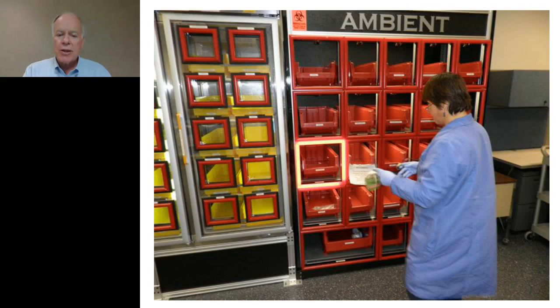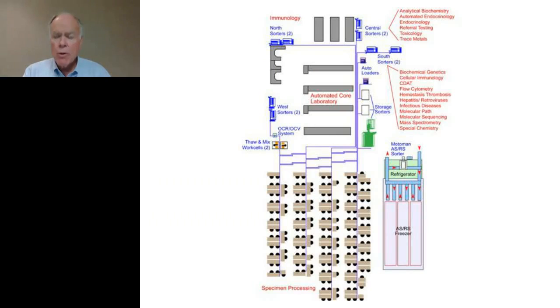So that's the sort-to-light system, and there's a section like this for ambient specimens and a section for frozen specimens and another section for refrigerated specimens. We're now building more of those systems to greatly expand that.